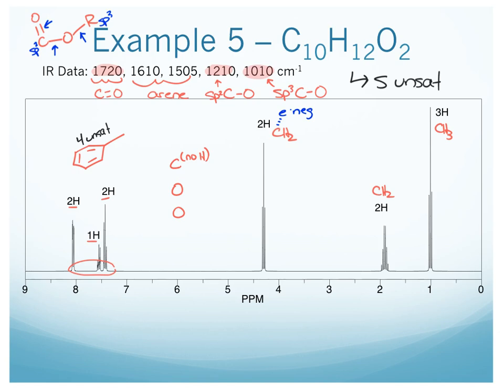So what we can do now is, to get a 5th unsaturation, it seems reasonable that we could take the carbon with no hydrogen and an oxygen, and use those to make our C double bond O. That gives us our 5th unsaturation. Now the reason I crossed these out is that way we don't use them twice. I'll still leave my note, no hydrogen. Okay, so let's use what we have and see if we can connect these together.